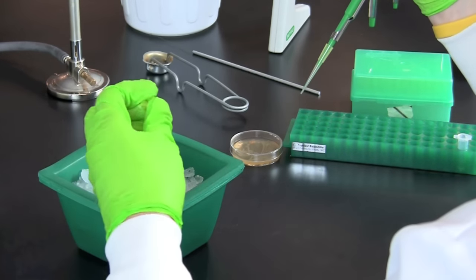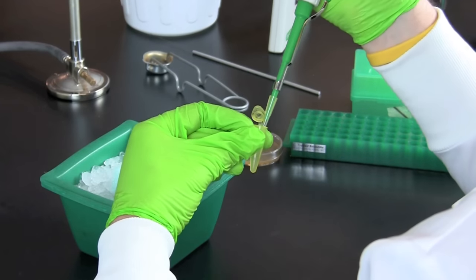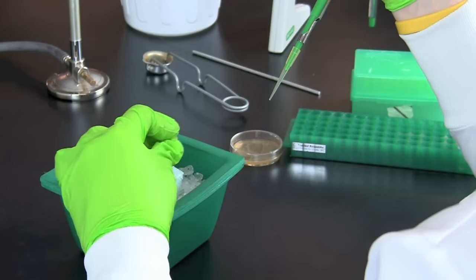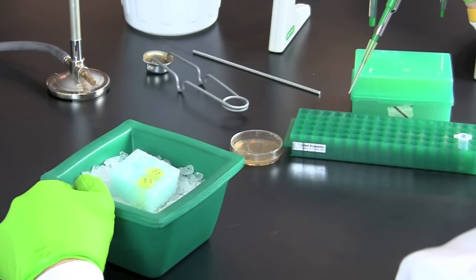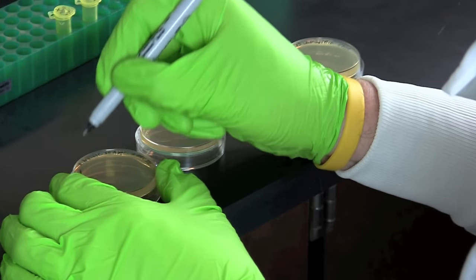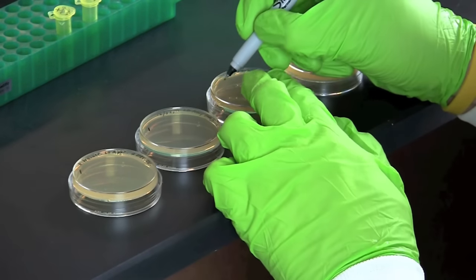Pipette the 10 microliters of plasmid into the plus tube. Do not add any plasmid into the minus tube. Incubate both tubes on ice for 10 minutes, making sure the tubes are in full contact with the ice. During the 10-minute wait, using a waterproof marker, label your LB agar plates according to the instructions provided with your lab protocol.